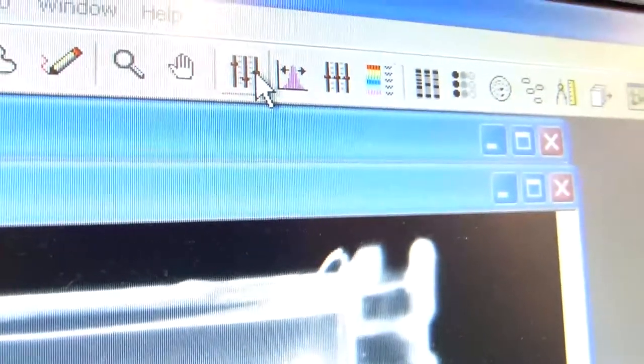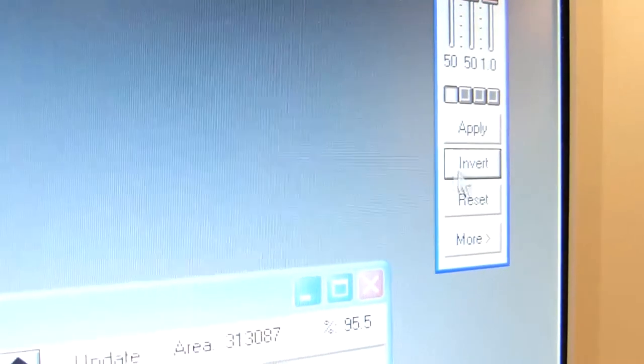From here you want to go to image enhancement and hit invert. We invert before printing to save ink.